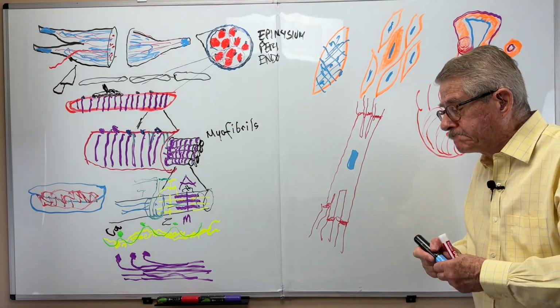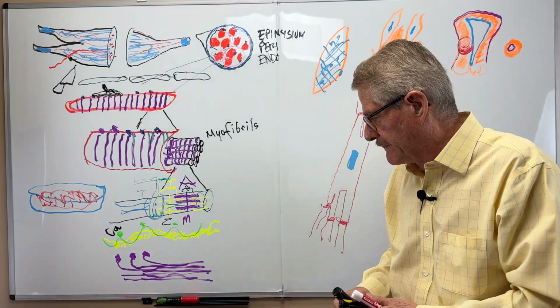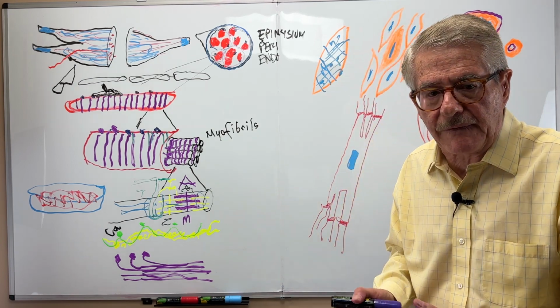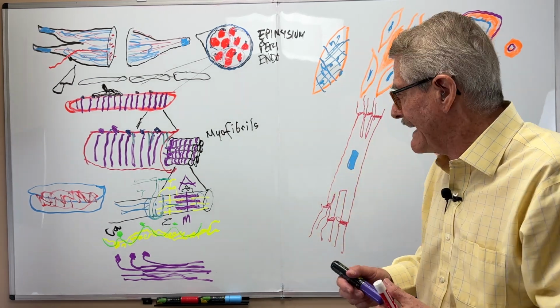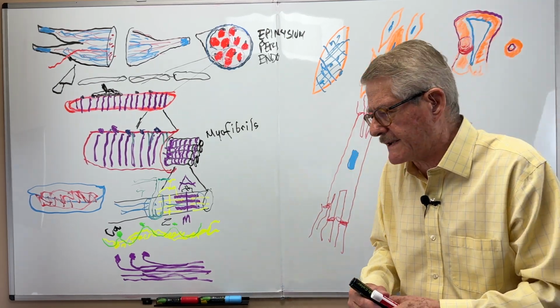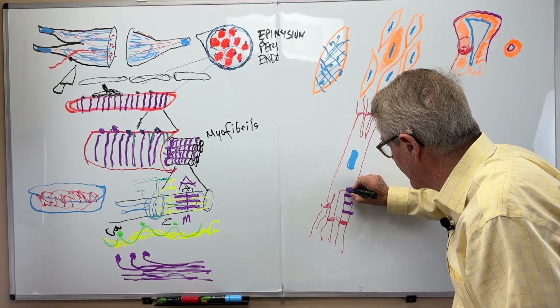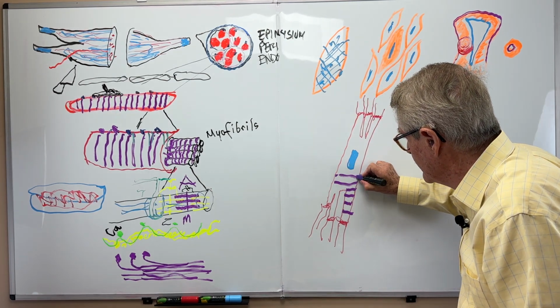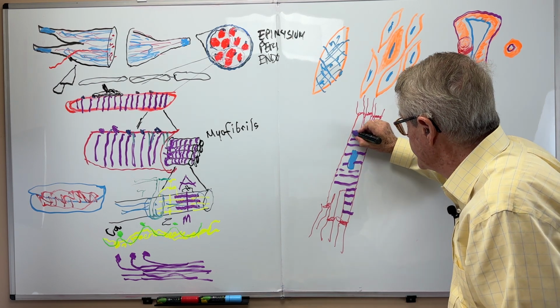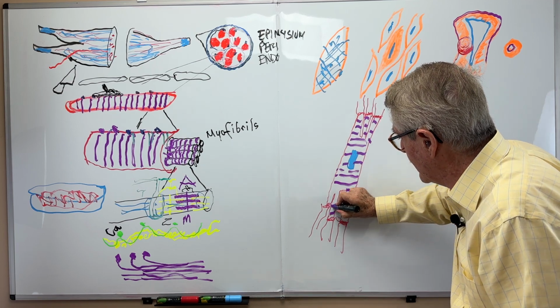And obviously, we are going to have striations. Why do we have striations in the heart muscle? Because there are numerous myofibrils, just as in the skeletal muscle. But these fibers are not so regularly arranged. But anyway, when you look at the skeletal muscle, the cardiac muscle, excuse me, you see that the heart muscle is striated the same way.